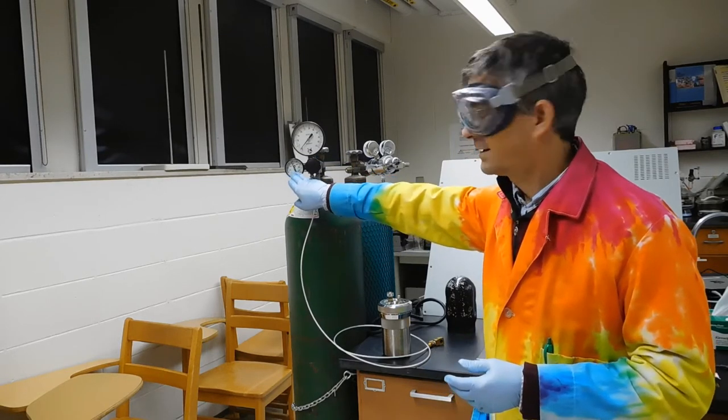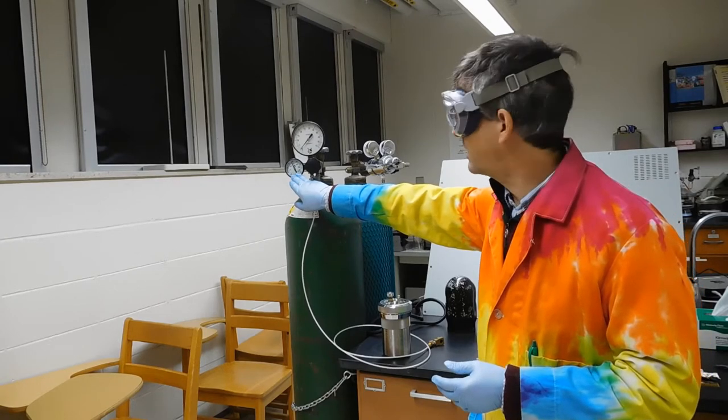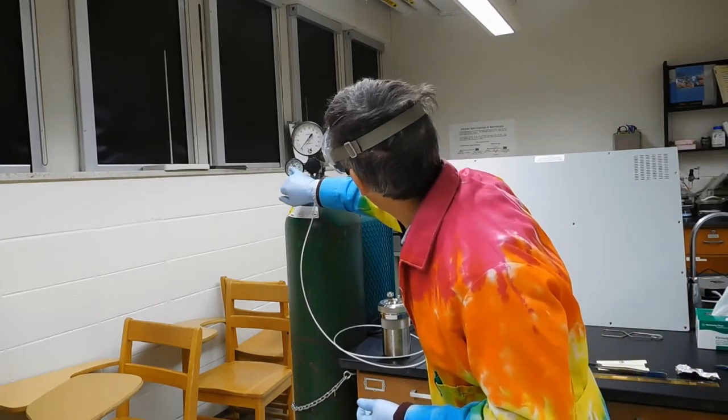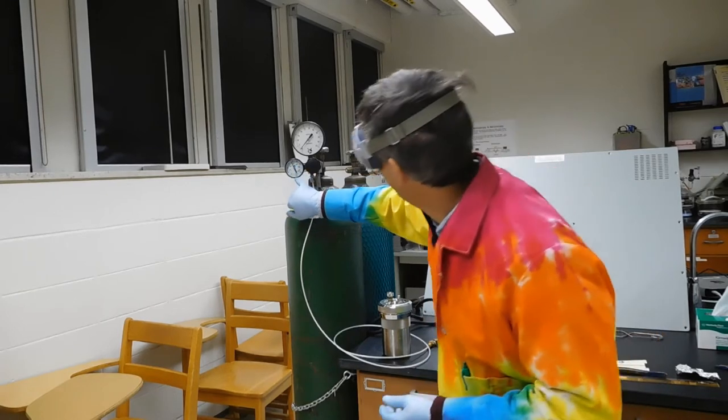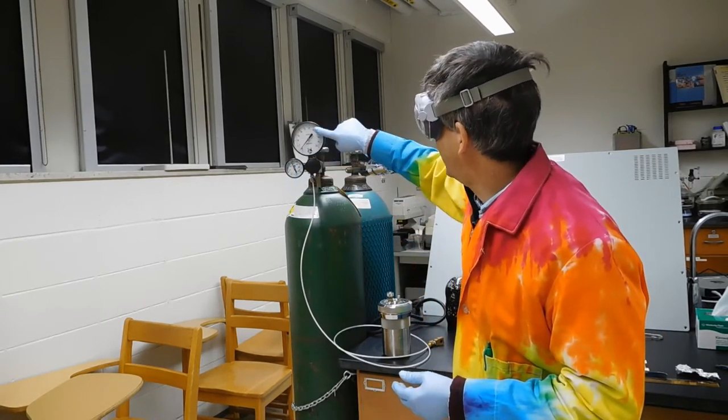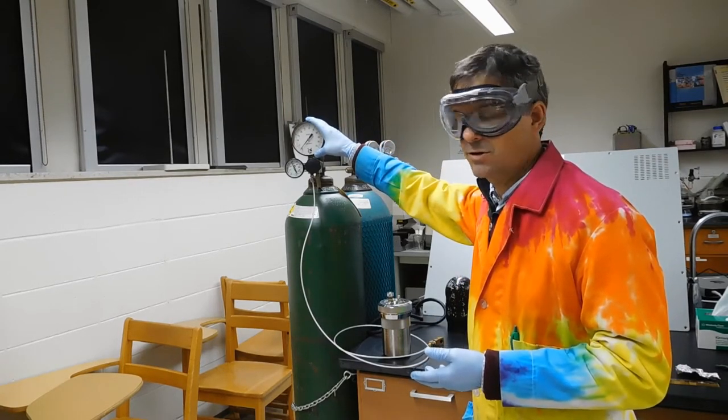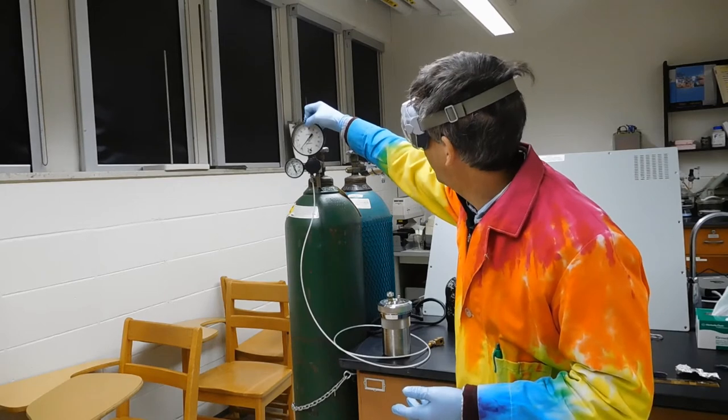The small dial here indicates the total pressure in the tank at the moment, and it's a little less than 1500 psi. This big gauge is going to tell us the atmospheres of oxygen we put in here. We're going to go to about 26.